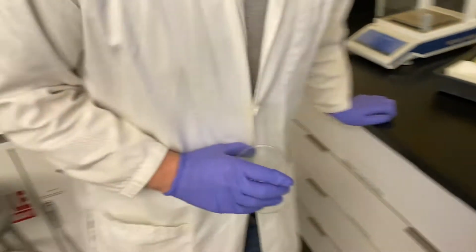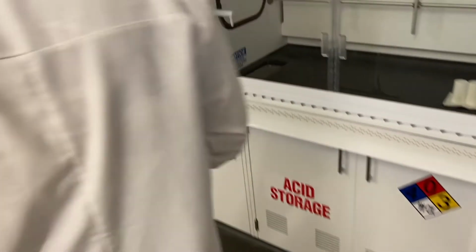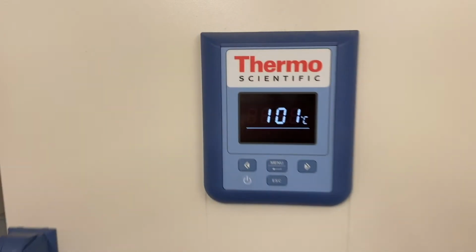And if it got a little bit lighter, that means it was still a little bit wet. So we actually got the rest of the water off. So this is just a good way to double check your work and get rid of some error.